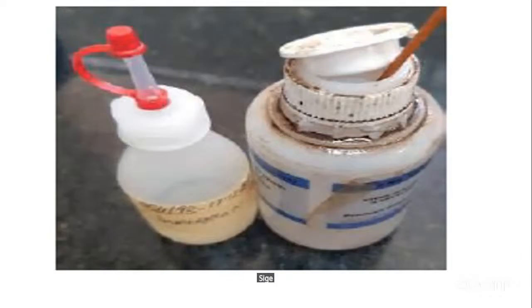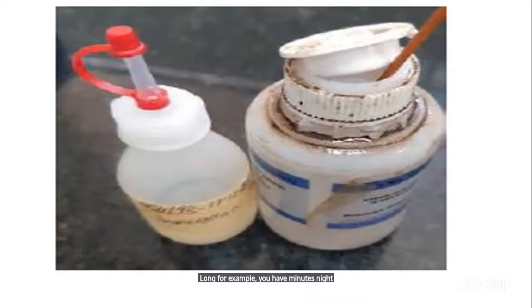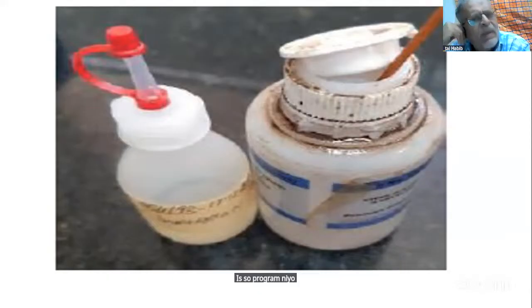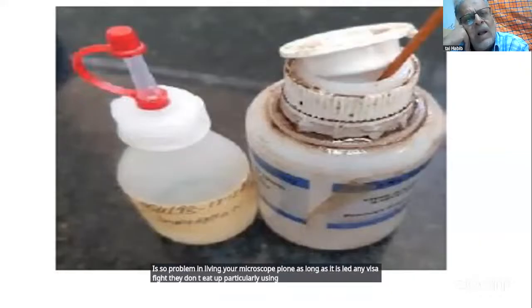Okay. Let me bring another one from Joseph Waroi, who is asking, is it advisable to leave the microscope lamp on for too long? For example, when you have many slides to examine. Thank you, Joseph. There's no problem in leaving your microscope lamp on as long as it is LED. LEDs are fine. They don't heat up. But if you are using a halogen lamp, it will heat up.